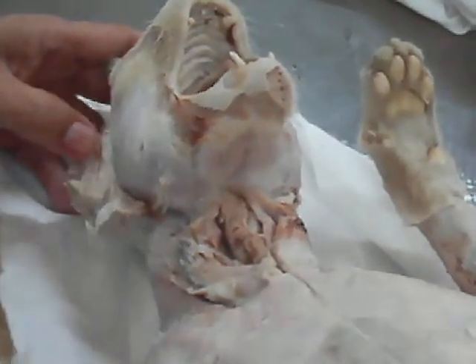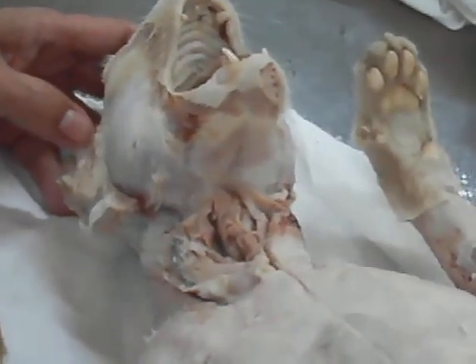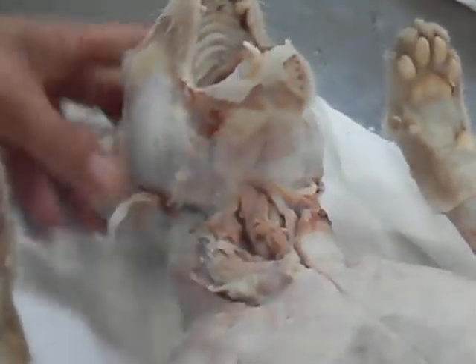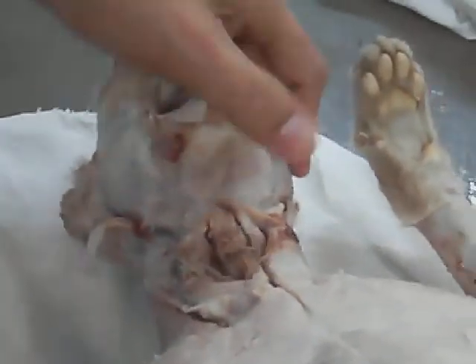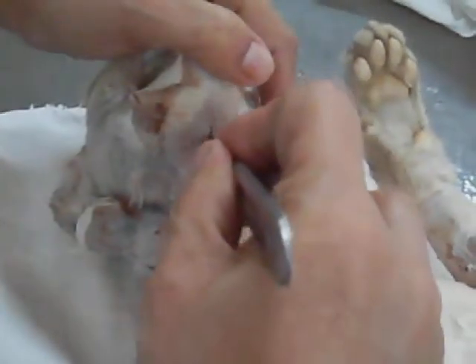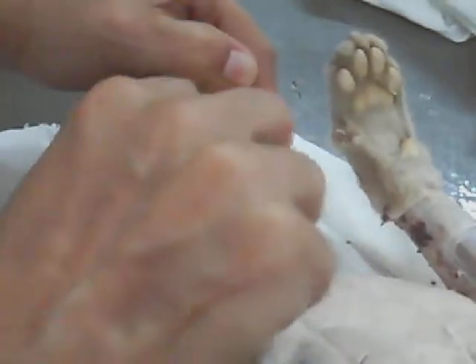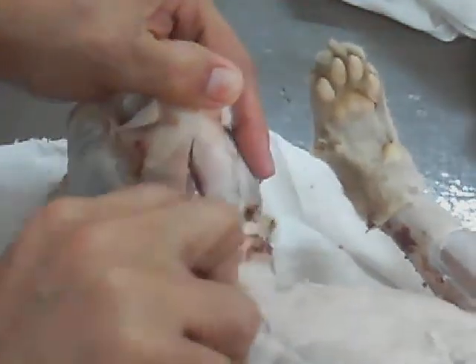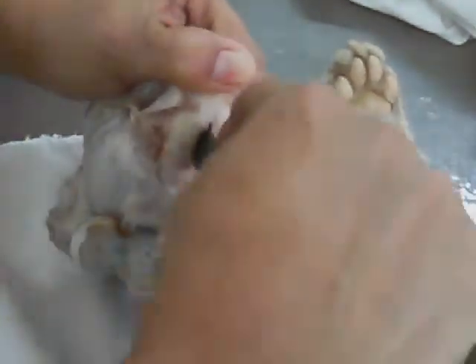Masseter. That is the muscle of your cheek. So when I pinch your cheek that way, I'm pinching on your masseter. Always use the back of the scalpel.